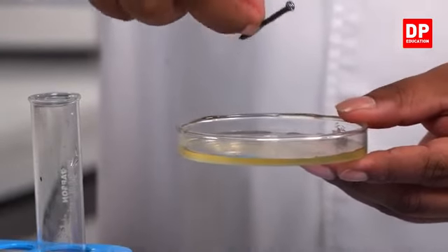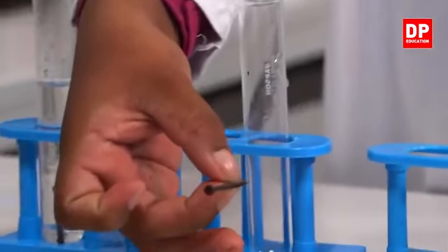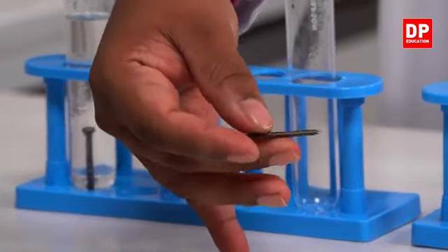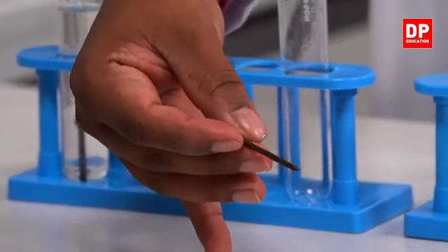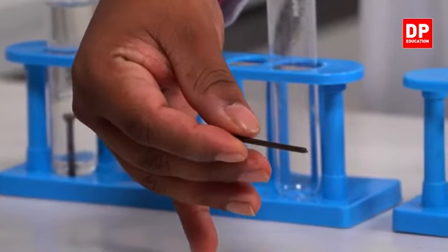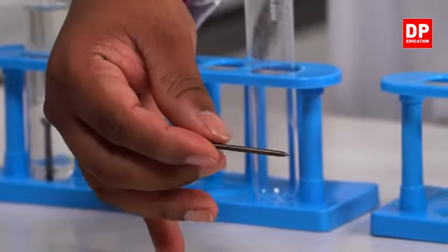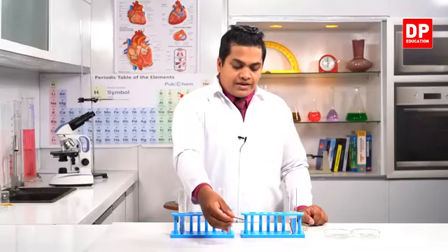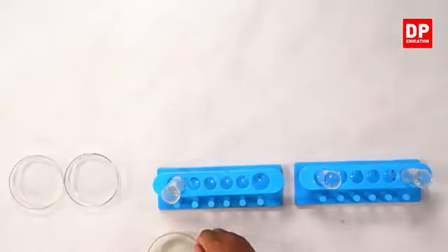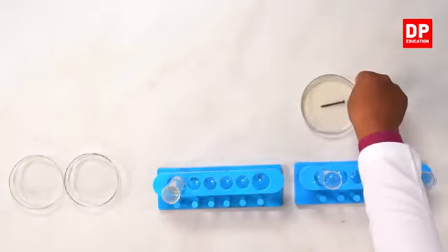So if you observe this iron nail, you can see it has rusted very well. See, it has rust all around the surface, right? So it has rusted very well. So I'll keep this iron nail on the Petri dish so that you can observe very clearly.